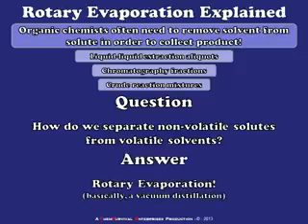And the answer is rotary evaporation, which is basically a fancy type of distillation. So let's think a little bit about what a rotary evaporator is and how it works, and then we'll watch one in action at the very end today.